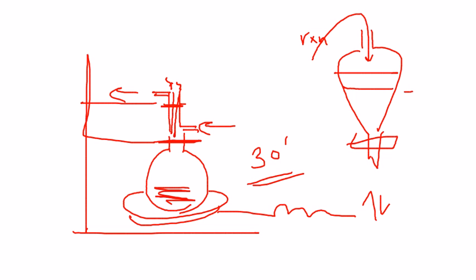So you're going to drain off the acid part completely, collect the top part, and just add an equal volume of water into this layer. The whole purpose is to remove any traces of any acid that might be present. And once you have done that and collected the layer again, you're going to transfer that into an Erlenmeyer flask.